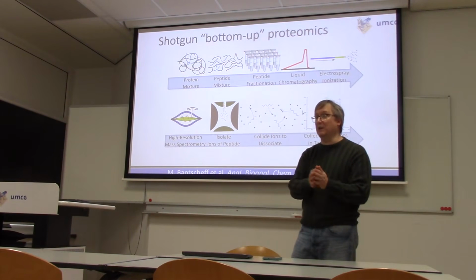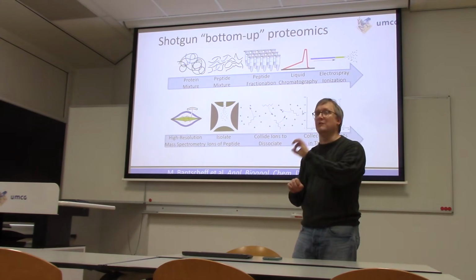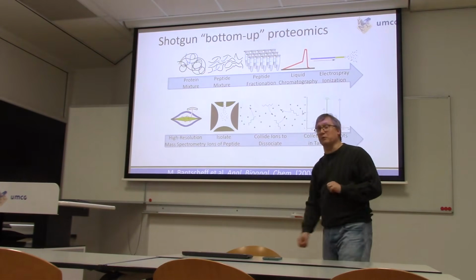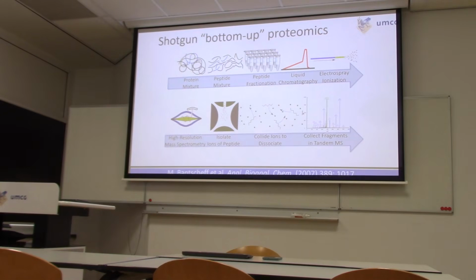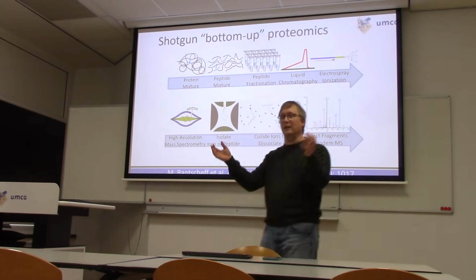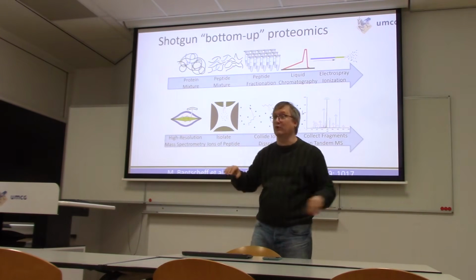So generally speaking, when people talk about proteomics, they're not talking about the investigation of intact proteins, but rather peptides produced from them. Very frequently you'll see that people, especially those dealing with very, very complex mixtures, are going to make use of fractionation. So fractionation is useful for subdividing one big, very complex mixture of all peptides from a sample into those that meet different biochemical criteria.